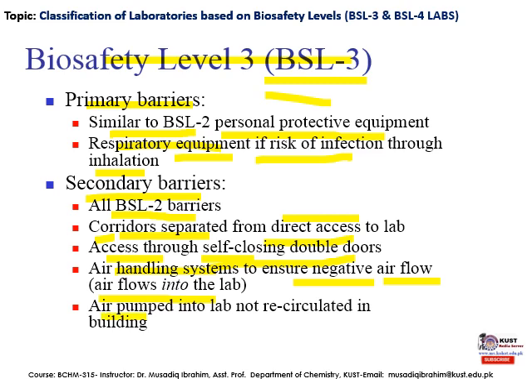Now the air which is pumped into the lab is not recirculated in the building. That is also important to observe: the air comes into the lab, and then it goes out through the exhaust system outside the building, but it cannot be recirculated inside the building.